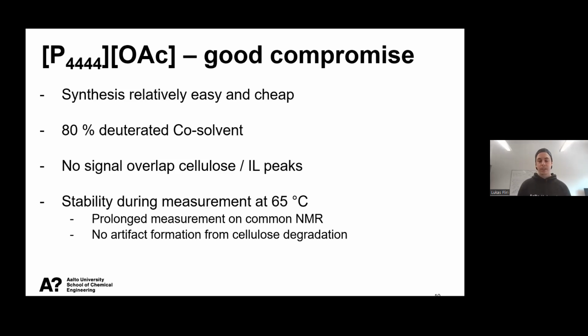They also did not get really developed further or did not develop a standard to follow, although the first reports date back already to 2004, 2005, I think. And what makes our NMR electrolyte a good choice is that the synthesis of the ionic liquid, following the metathesis or synthesis schemes presented in the protocol, is relatively easy and can be performed from cheap compounds you can get from Sigma Aldrich.